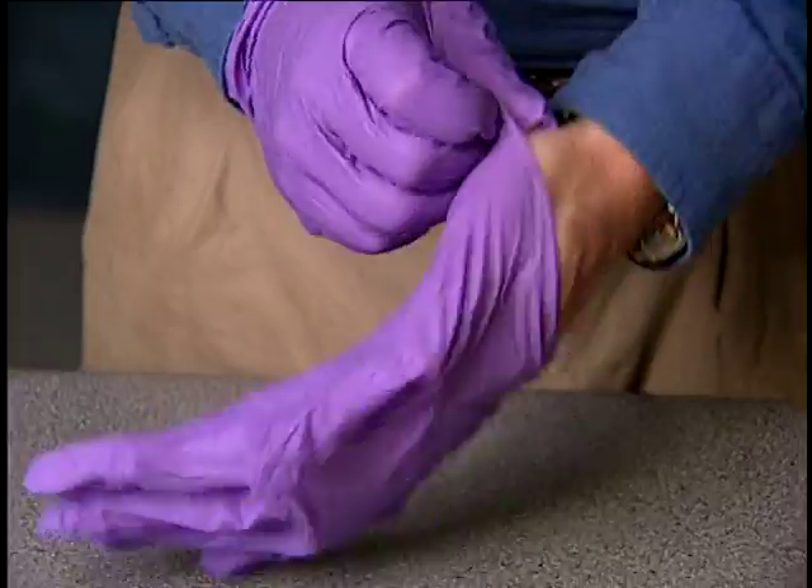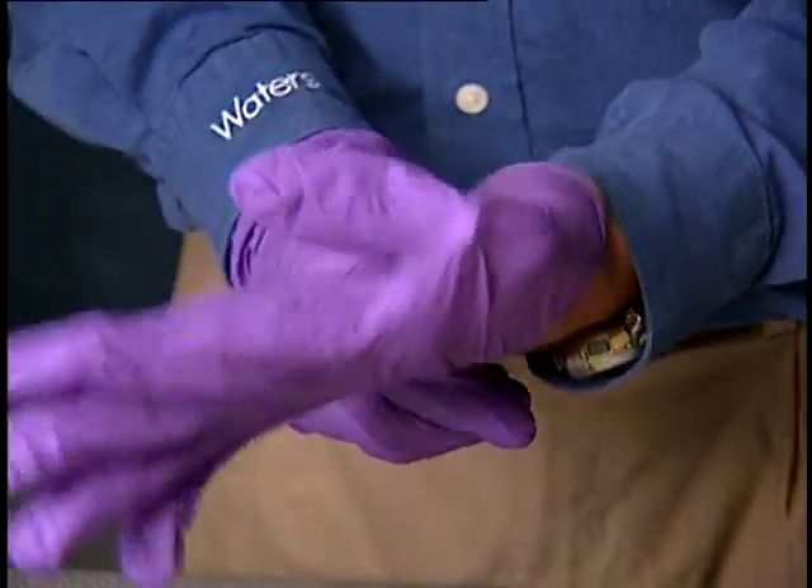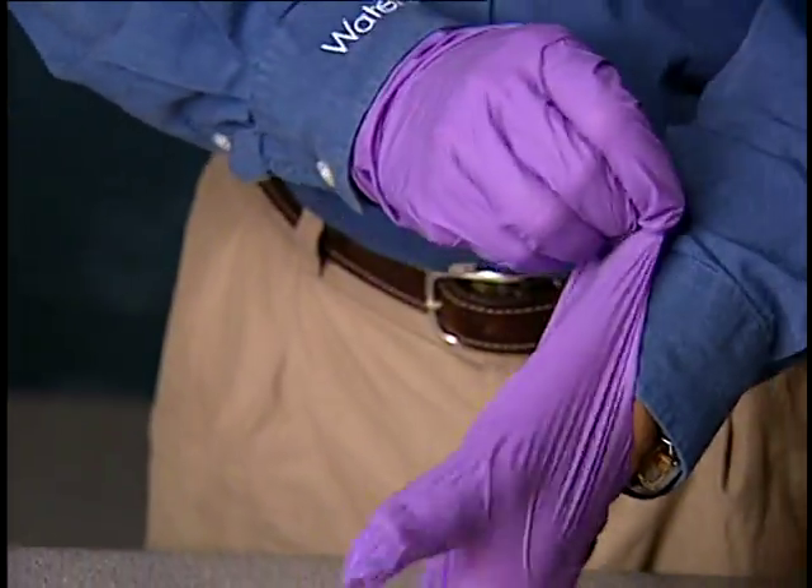To avoid recontaminating the ion block assembly, wear clean, chemical-resistant, powder-free gloves during this procedure.